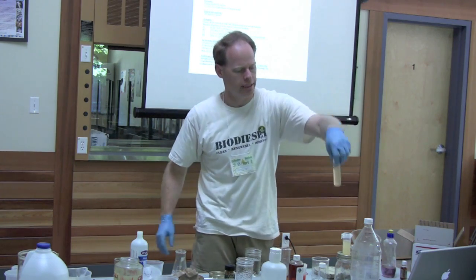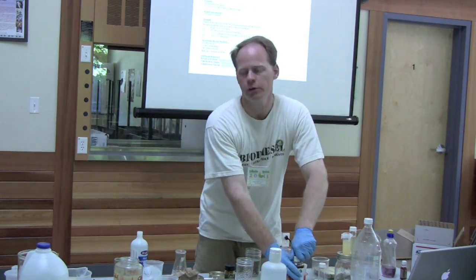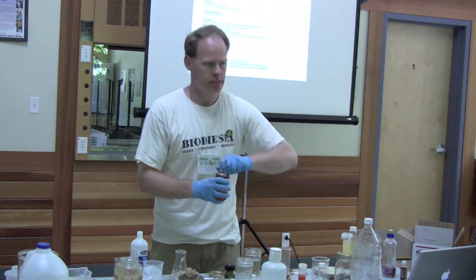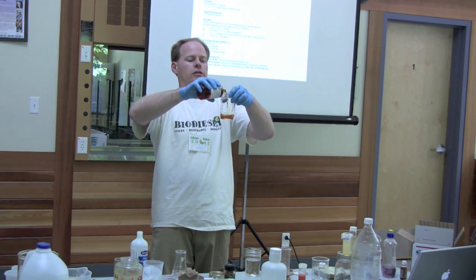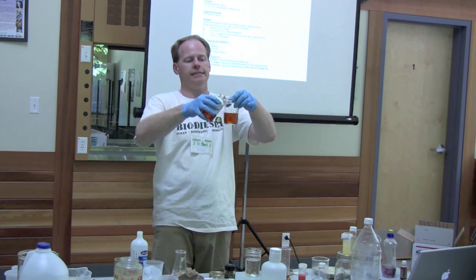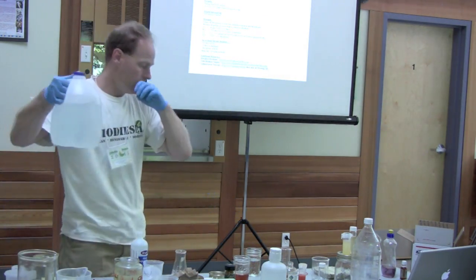This does kind of look like it's passing. A really quick and dirty test to see if you're finished washing the fuel is called a shake 'em up test. What you do is you fill a little metal jar or a little glass jar. The reason I like glass is it's just easier to see through than plastic. Plastic's kind of opaque. Then I take some distilled water.